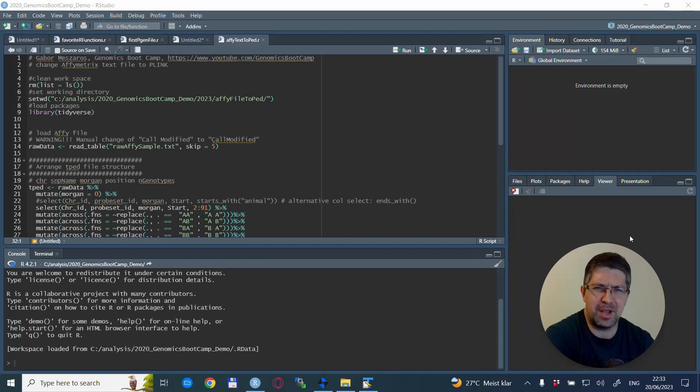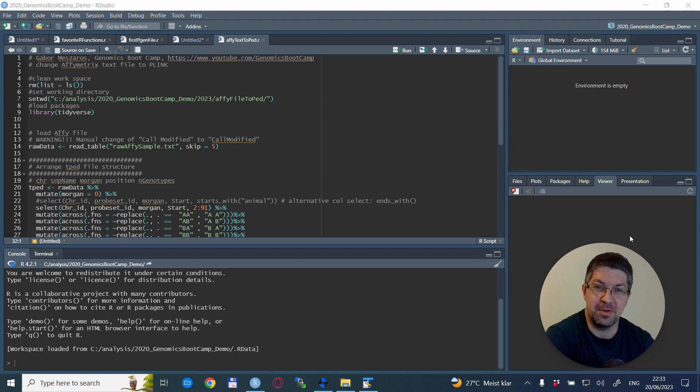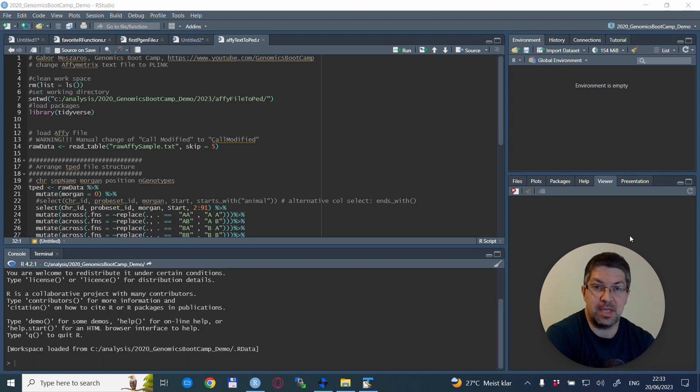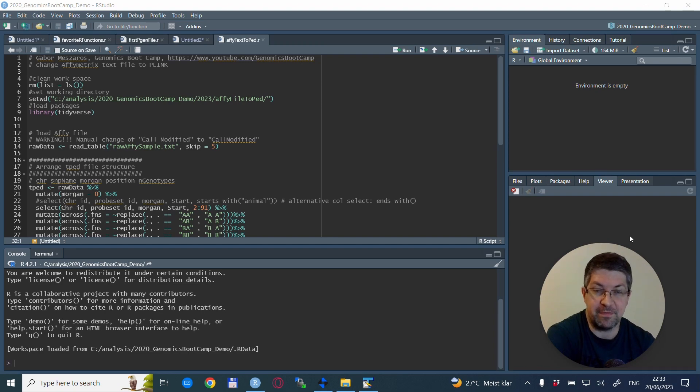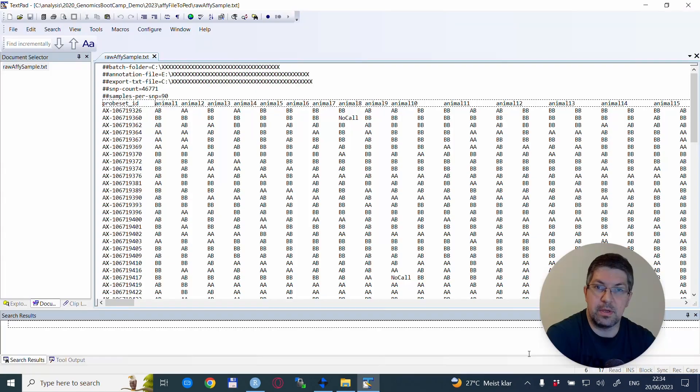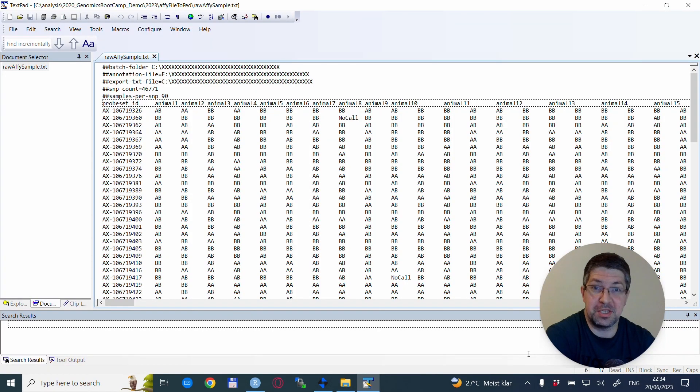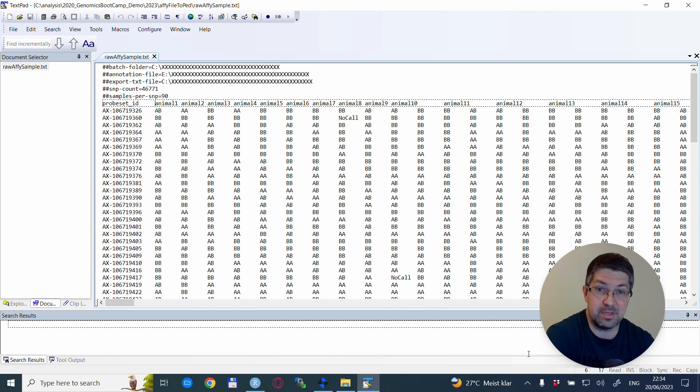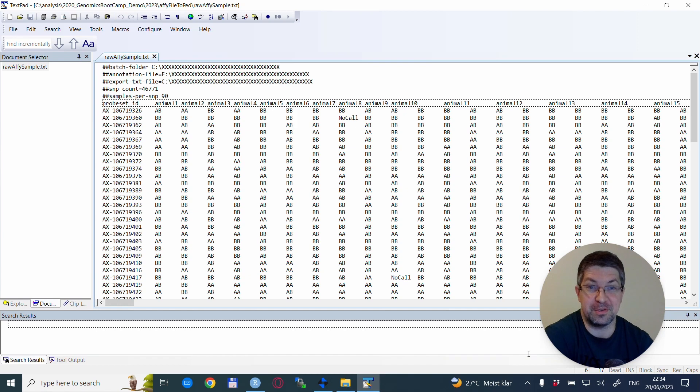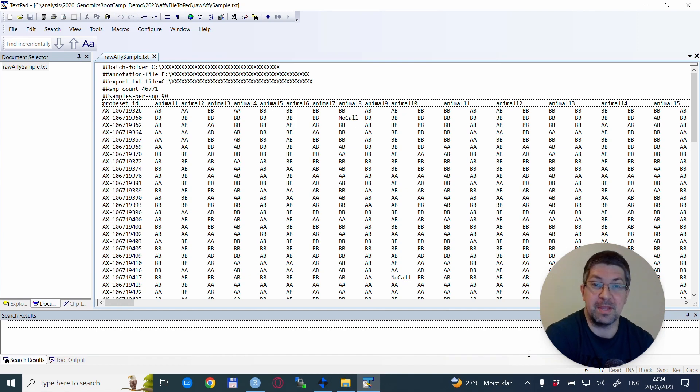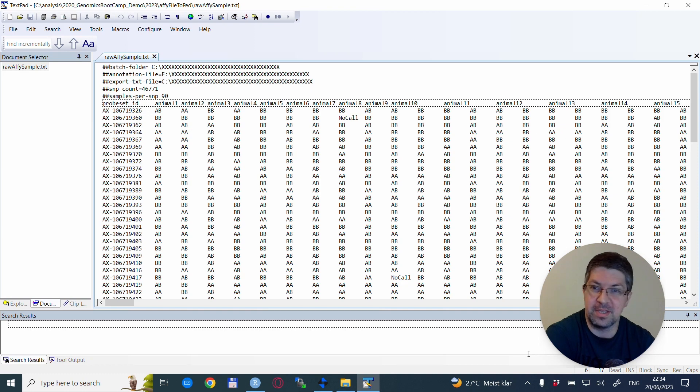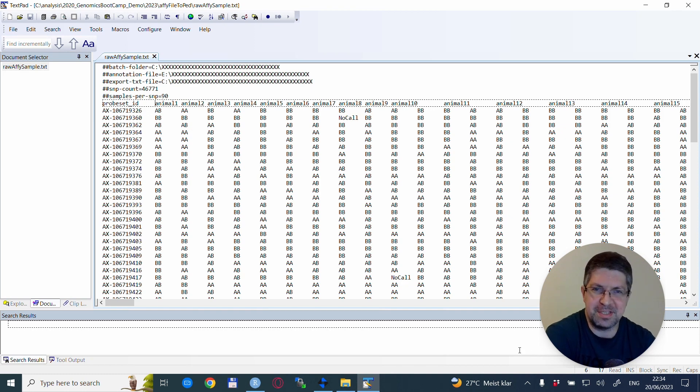Hello everyone, welcome back to the Genomics Boot Camp. Back again with another video. This time we are changing the Affymetrix input file to plink files. Let's jump straight into it. So this is how an Affymetrix final report looks like. I'm not sure if it's called final report, but anyway, if you are getting your Affymetrix raw files, they look something like this.